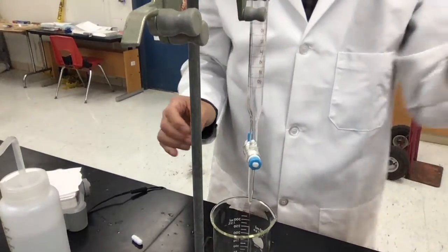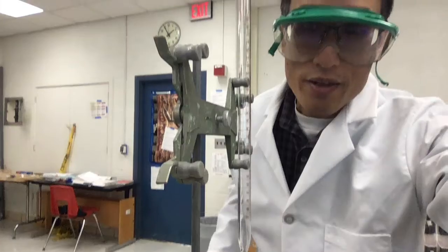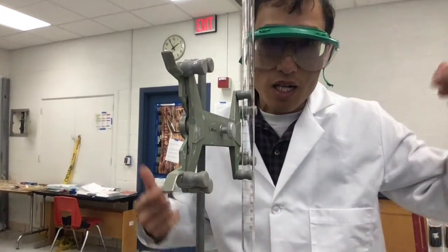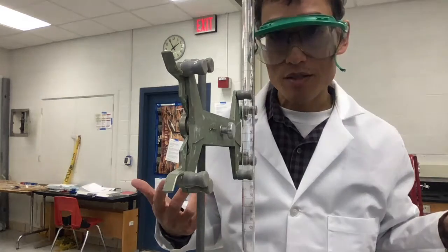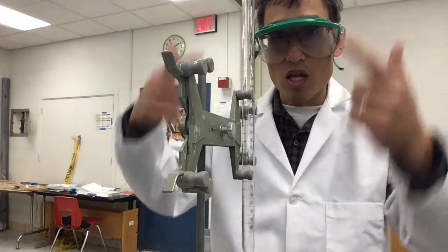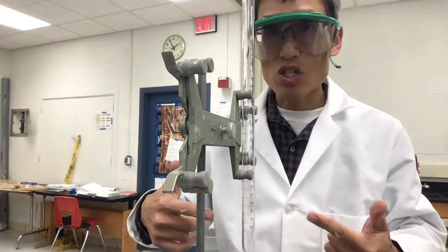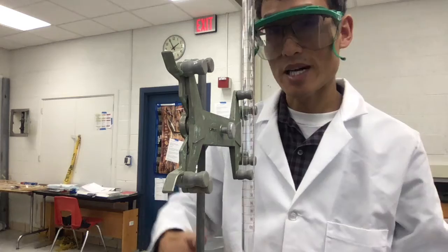So you can see a waste beaker. I'm just going to do that, rinse once. And then I'm going to rinse it with my solution a couple times. Always, before you do a titration, you want to make sure that the concentration of whatever's in the Buret is uniform throughout the entire thing.